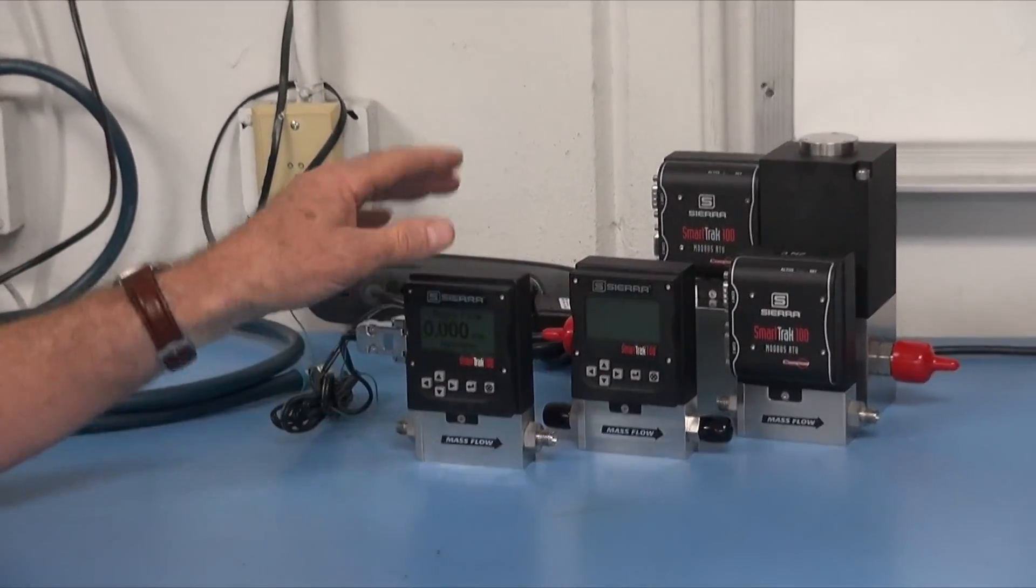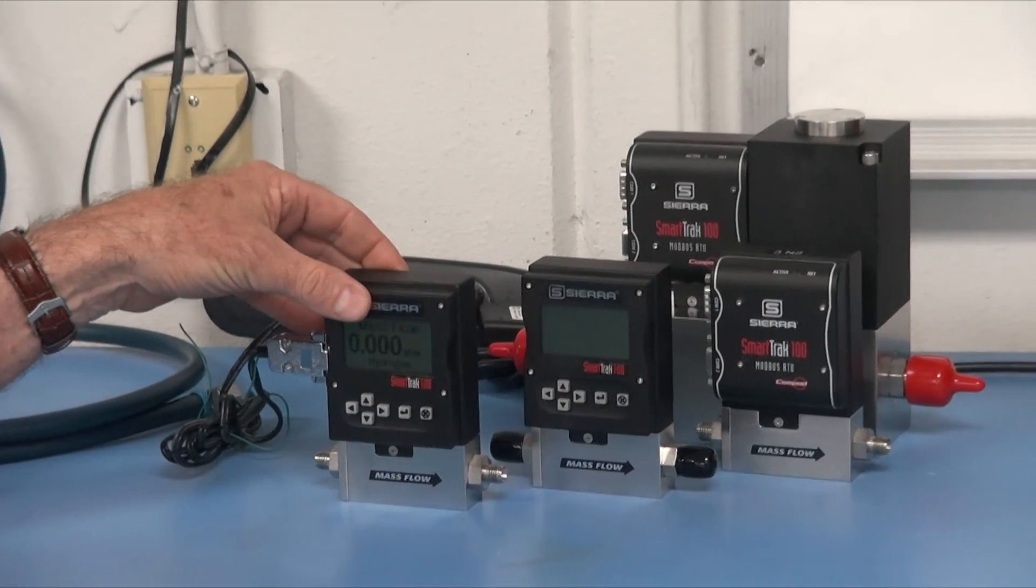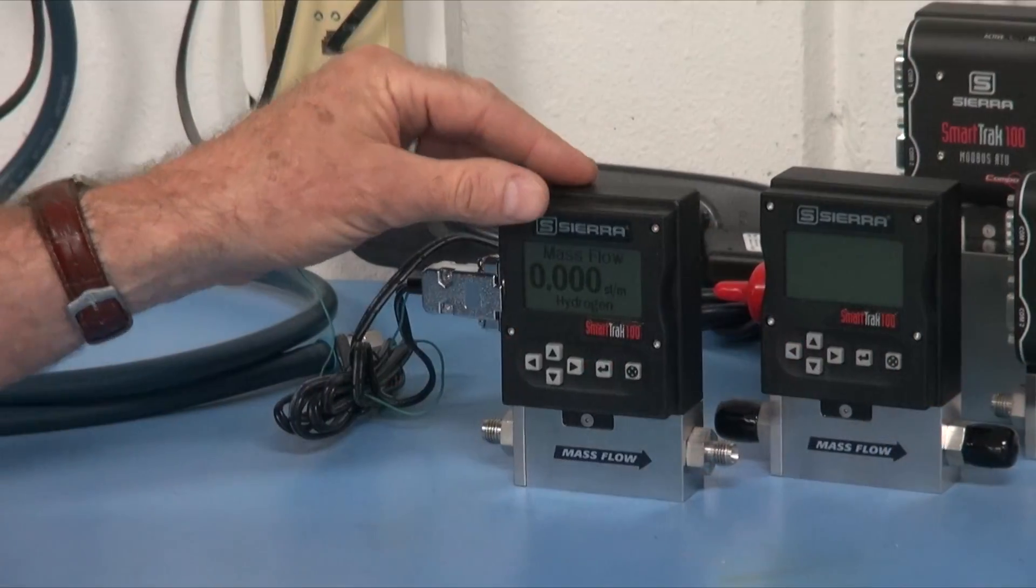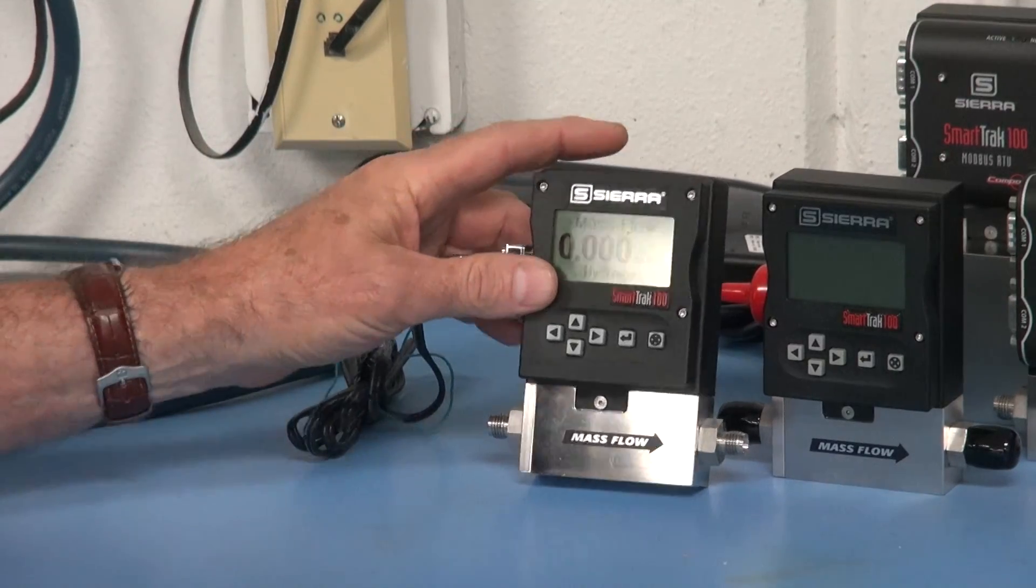But you might wonder what some of these features are on these controllers. I want to just zoom in a little bit on the display here and show you what we can do.